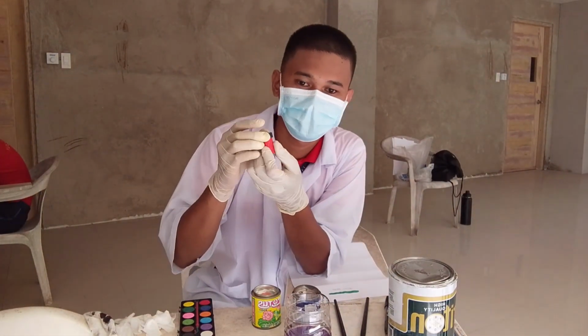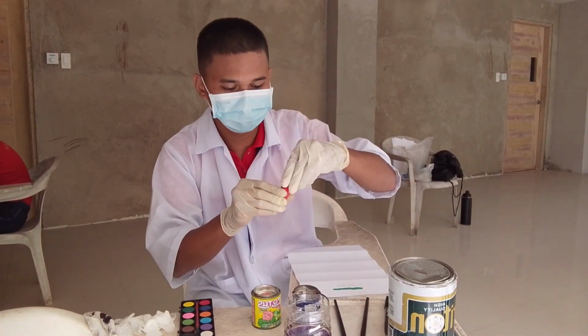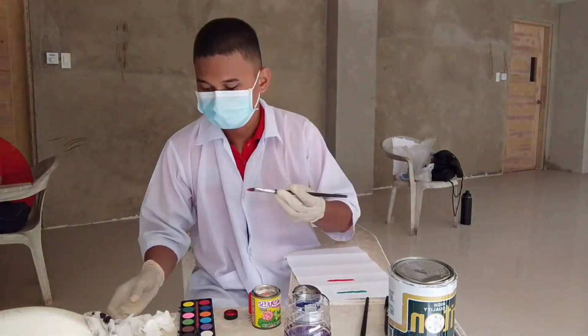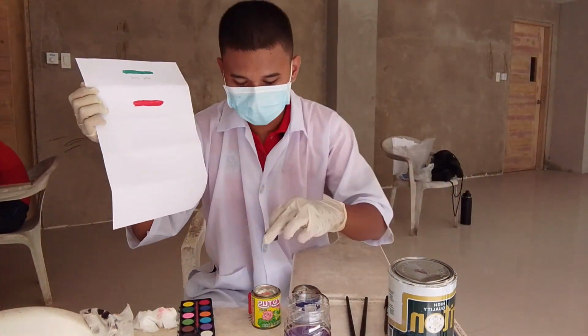Next is the acrylic. Acrylic is a type of paint that is used for modern and abstract paintings. I will now collect a sample. Got here the sample of the acrylic paint.